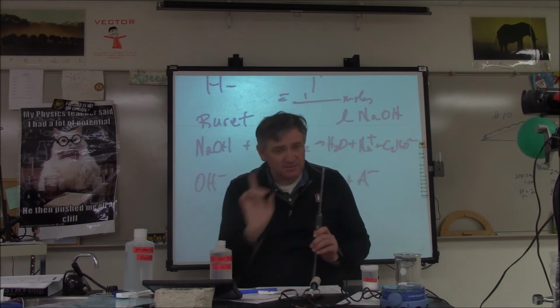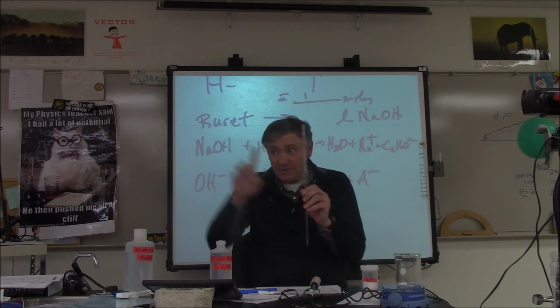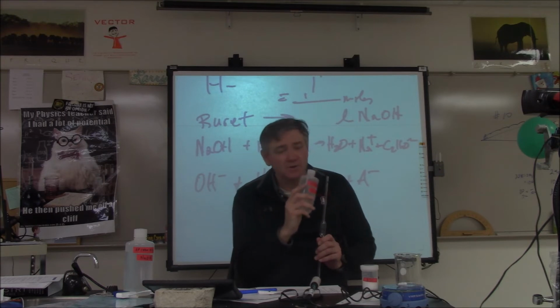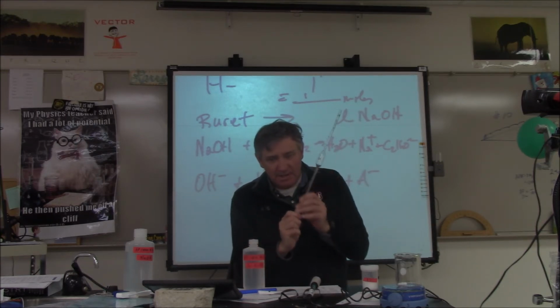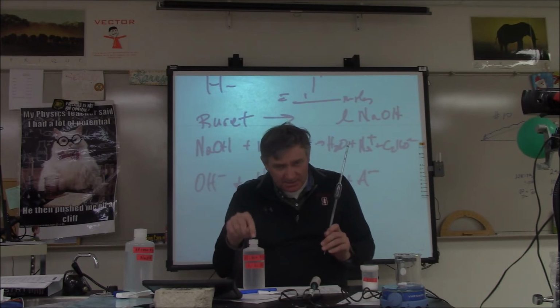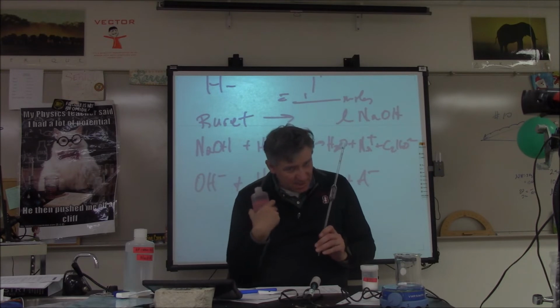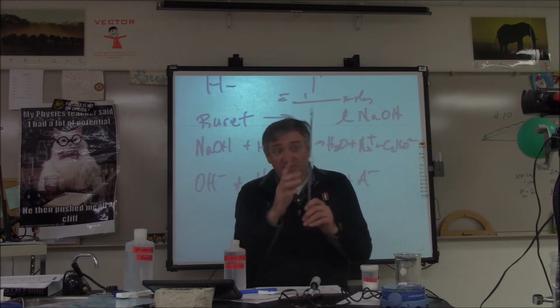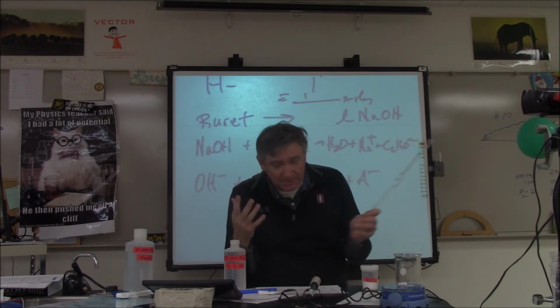And again, here's the cardinal sin. Do not take this 25 milliliter volumetric pipette, which is going to be on your table, and draw it directly out of here. Cardinal sin. Because here's the reason why. If this is contaminated, you have now contaminated this entire stock solution bottle. So what you want to do, again, don't do the caveman chemist. You want to pour this out into a beaker. Obviously, you're going to need 25 milliliters. I'd maybe pour out like 40, something like that.